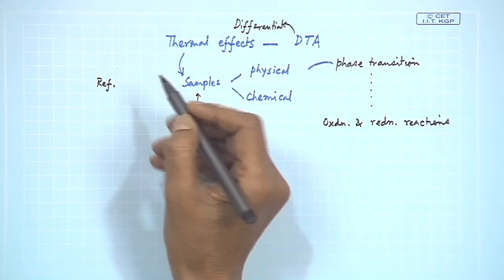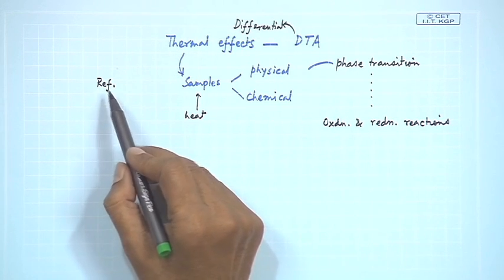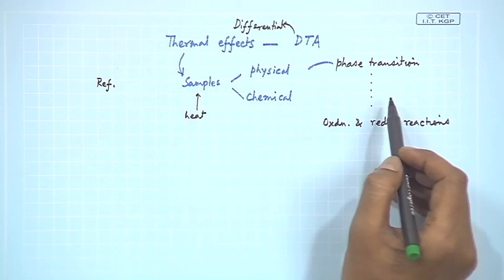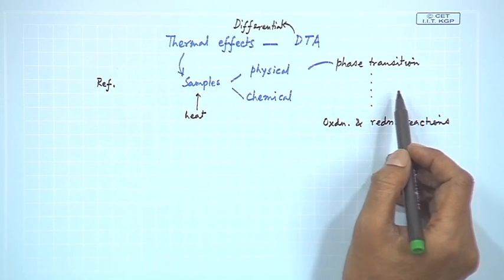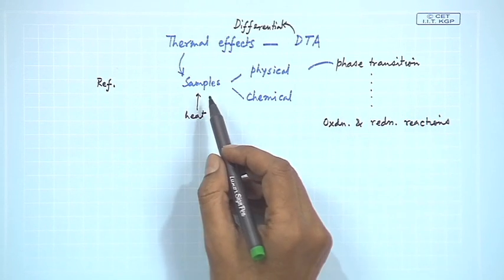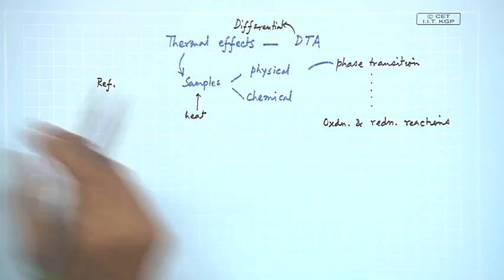As we all know that when we do spectrophotometric estimation, we have some reference sample such as your solvent itself. So, compared to this particular reference material, we heat the sample, then we try to record the corresponding trace what we get due to the corresponding heating of the sample as well as the reference material inside one particular furnace.